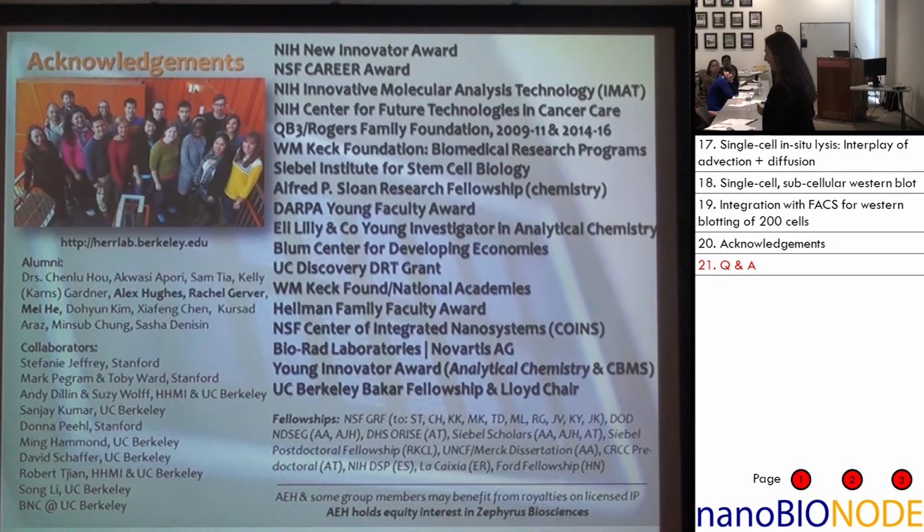Yeah, quantitative. Absolutely. We have used this assay to perform quantitative protein level measurements, and we also use qualitative as well across the spectrum. So we can say high to low, medium, or somewhere in between. But when we do careful control of losses at each step, we can then back out quantitatively how much mass we think is there. It's two different assay designs, because for quantitation we have to be a little bit more rigorous, which takes a little bit longer.